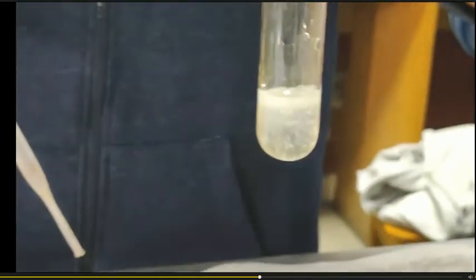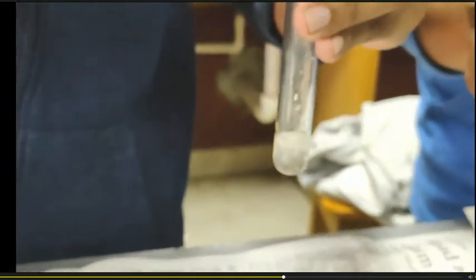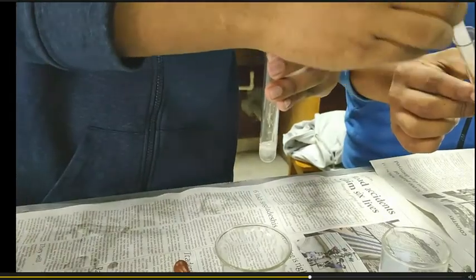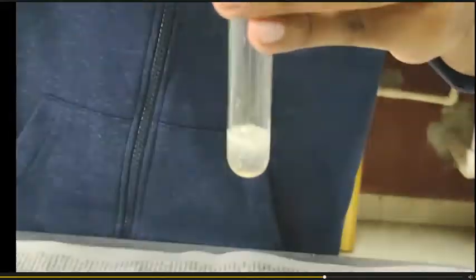Into this PPT containing test tube, if glacial acetic acid is added, then this PPT will disappear and form a solubilized solution. Now we are adding 100% pure glacial acetic acid into this PPT, and this will be solubilized.